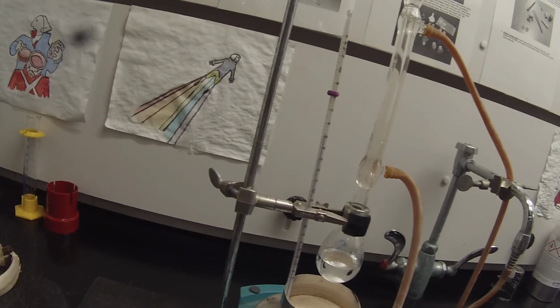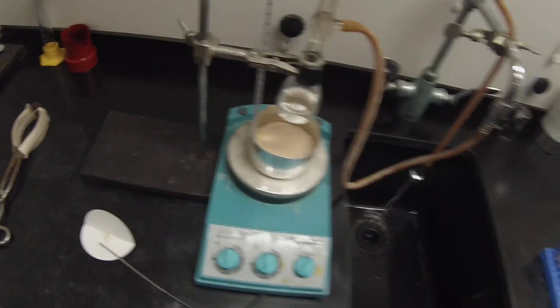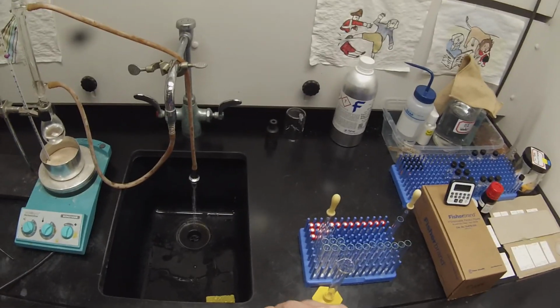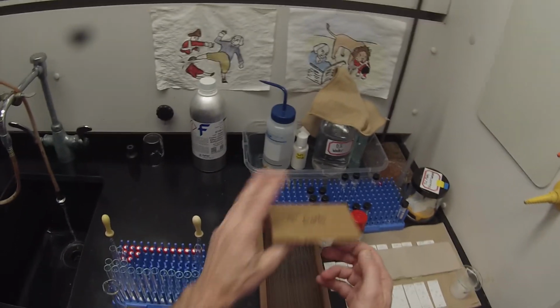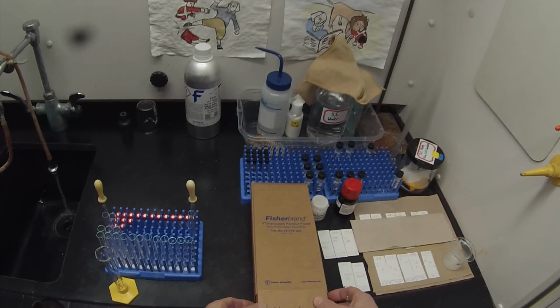So we're at a temperature of about 152, and it seems to be pretty constant at a hot plate setting of 250, so that's good. I'm going to use the same pipette each time. I'm actually going to use one of these longer 9-inch pipettes to reach into the reaction without burning myself.